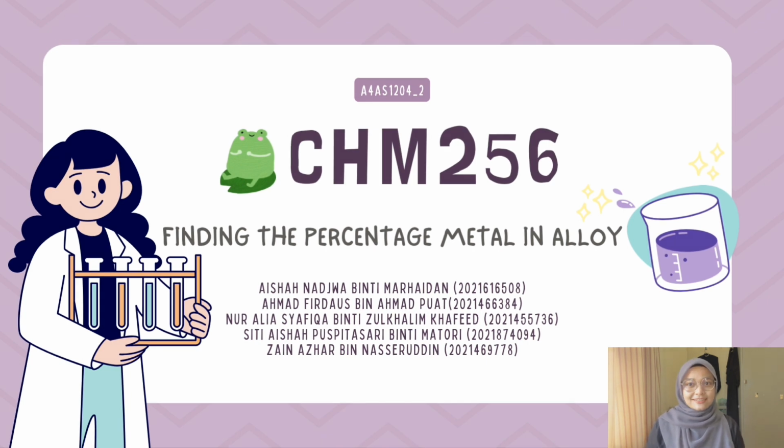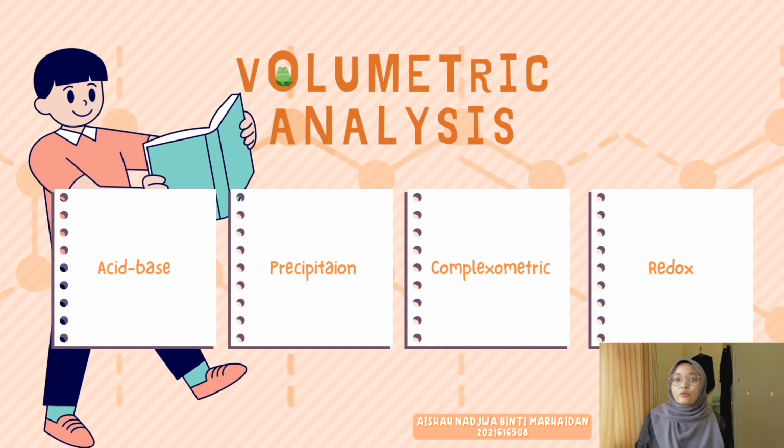So, let's get started. First of all, we have to know that volumetric analysis consists of acid-base titration, precipitation titration, complexometric titration, and redox titration. There are three other types of titration, which are blank titration, direct titration, and back titration.